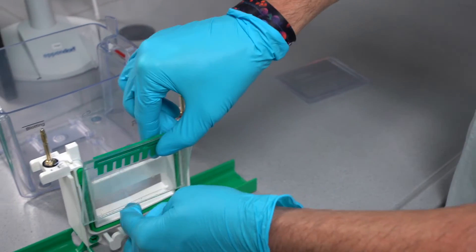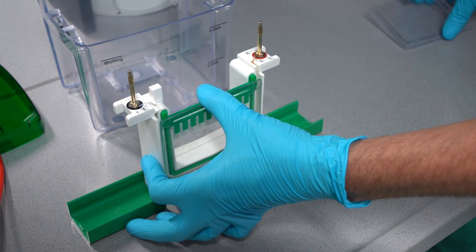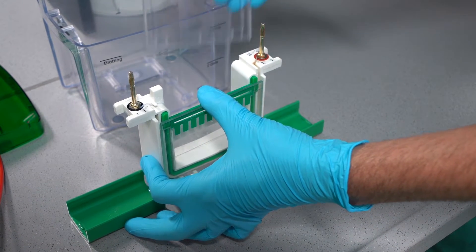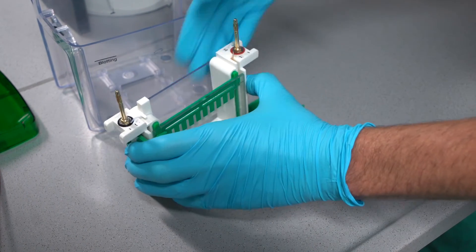When placing the gel, make sure that the spacer plate is facing outwards and the short plate inwards. By placing the gel in the buffer dam or two gels into the electrophoresis frame, an inner chamber is created that will be filled with buffer.